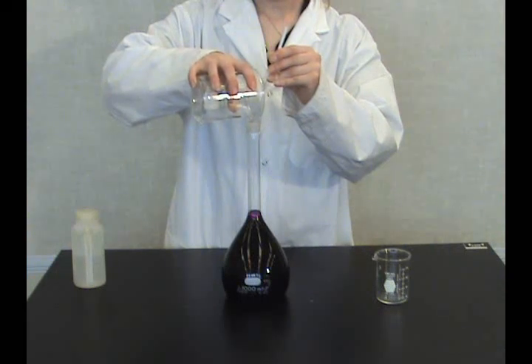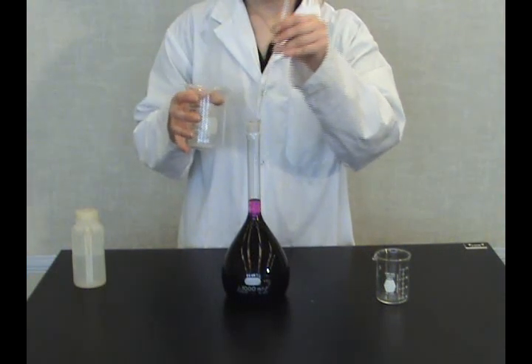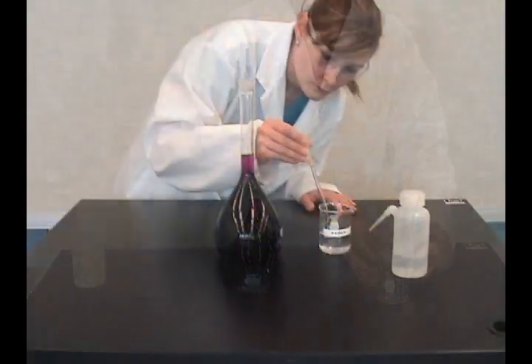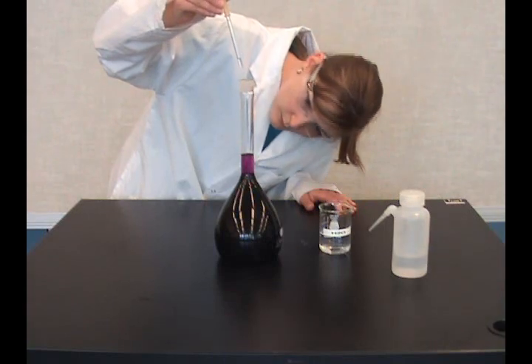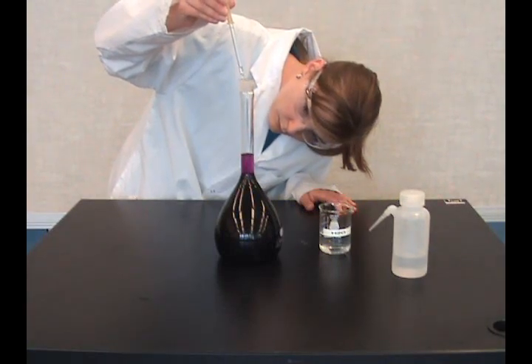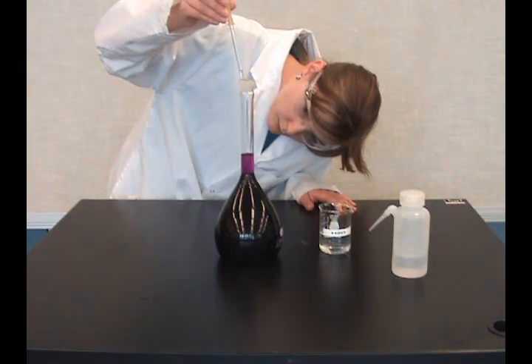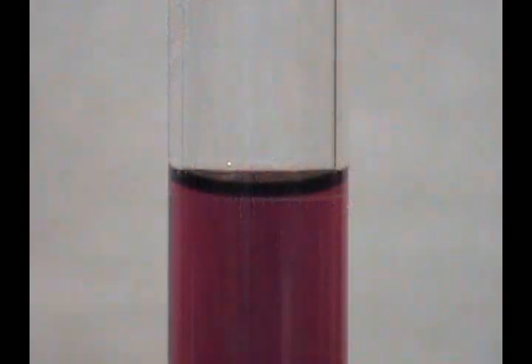Continue filling with water until just below the etched line. Add the water drop-wise with a Pasteur pipette until the bottom of the meniscus curve is sitting on top of the etched line.